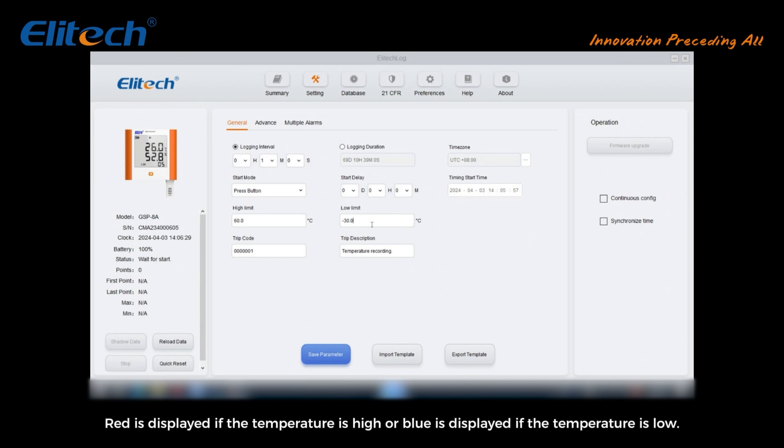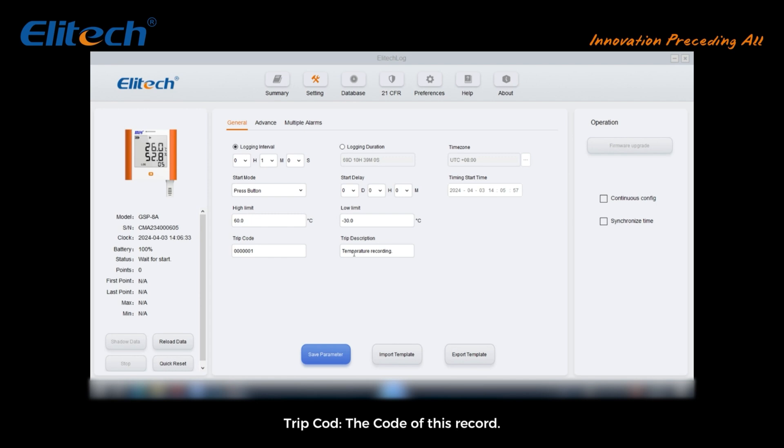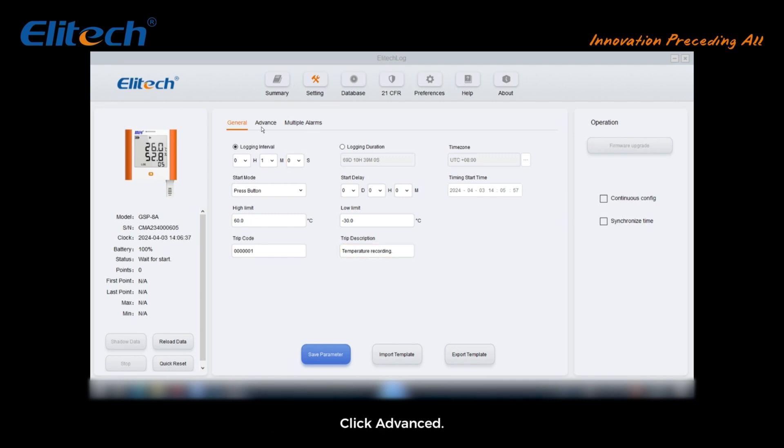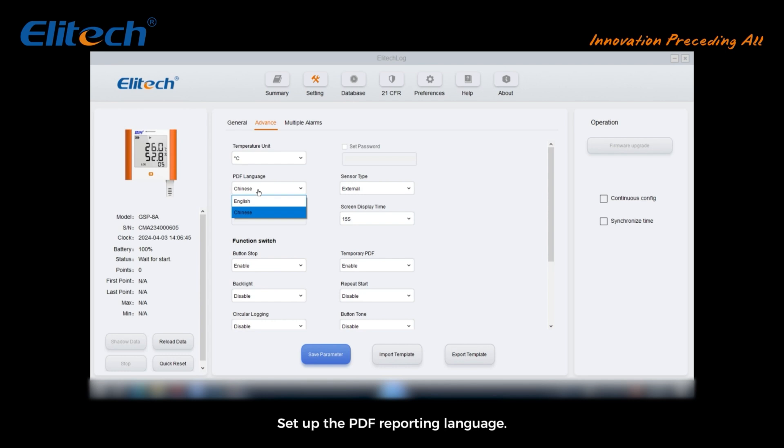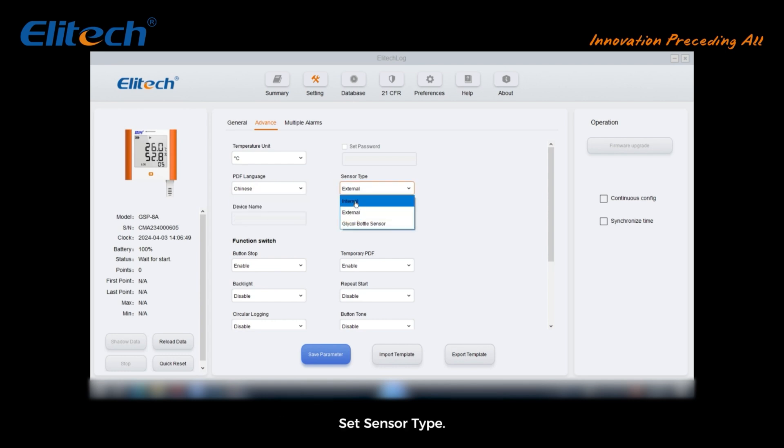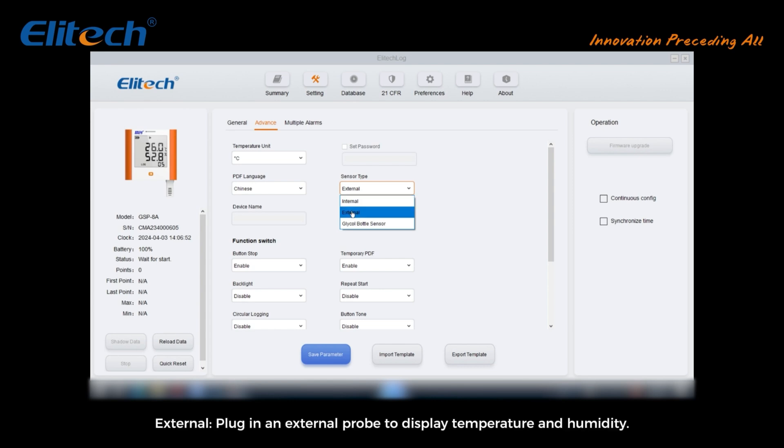Trip code: the code of this record. Trip description: the description of this record. Click advanced: set temperature unit degrees Celsius or degrees Fahrenheit. Set up the PDF reporting language. Set sensor type: internal shows temperature only. External: plug in an external probe to display temperature and humidity.